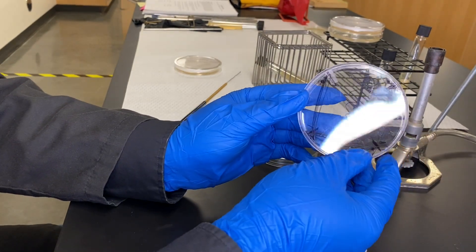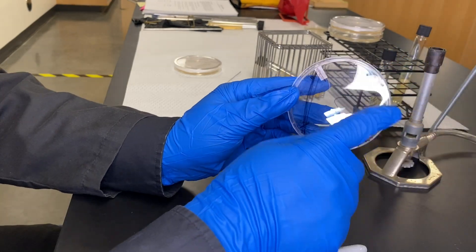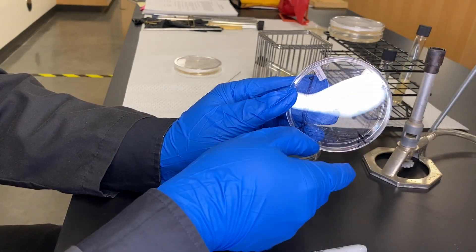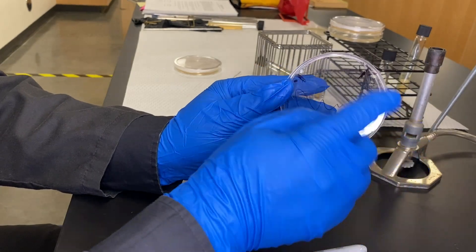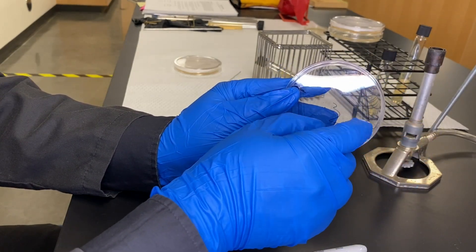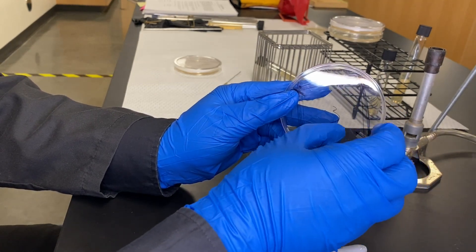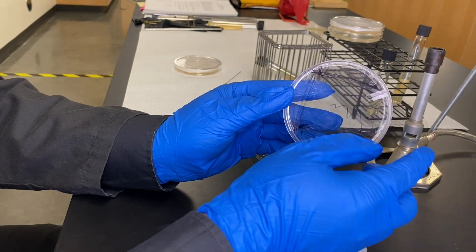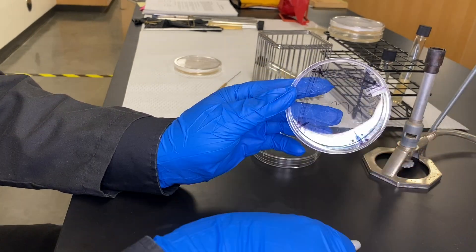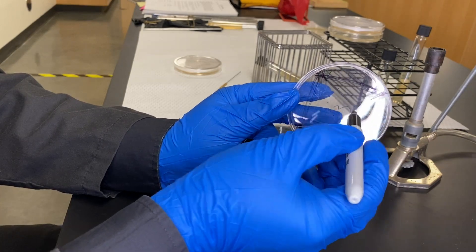What you've done successfully is take a sample that was heavy with both cultures and thinned it out. Each time you turn the plate, you thin it out a little bit more, so little by little you're making colonies separate out and become individualized or isolated. At the very last streak, you should be able to have individual little dots growing as isolated pure cultures.